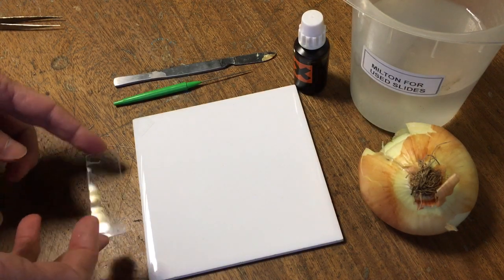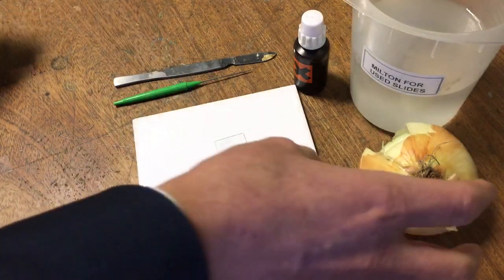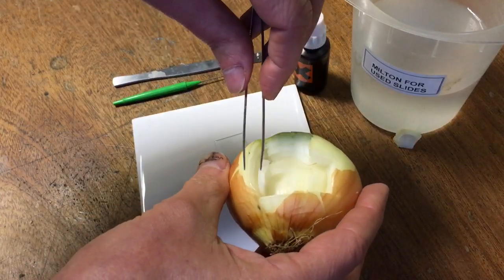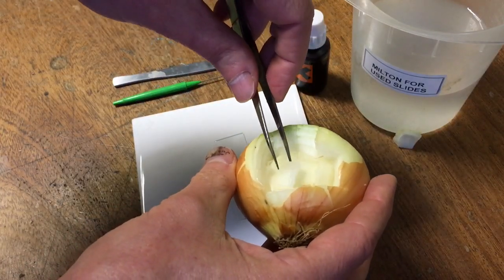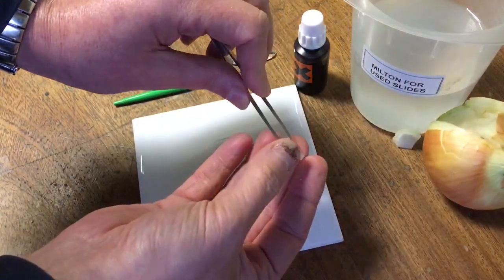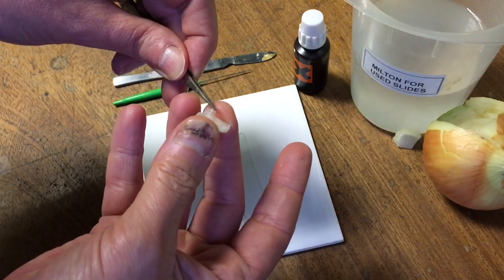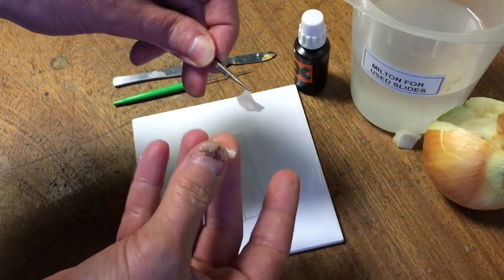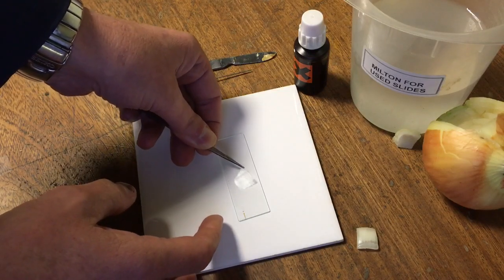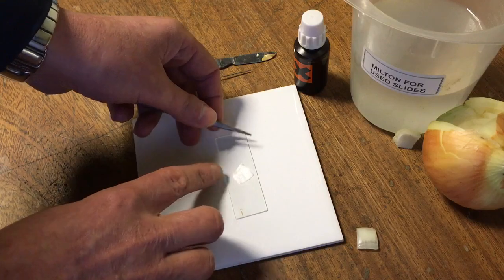Preparation of an onion cell slide. Here I have a clean glass slide that I'm going to prepare to view under the microscope. I'm going to take a piece of tissue from this onion and remove the thin layer of tissue on the back of this section, taking care to keep it flat and lay it smoothly out on the glass slide.